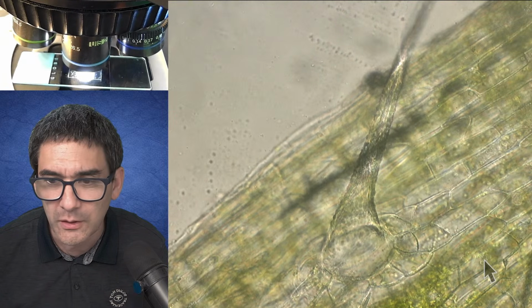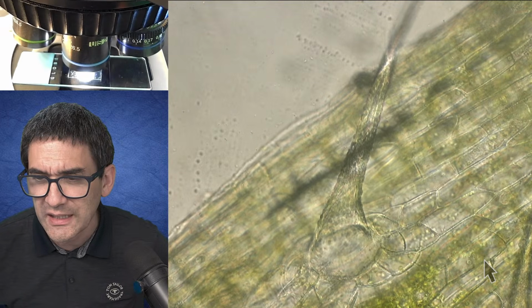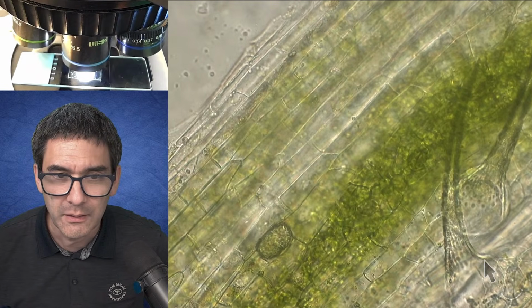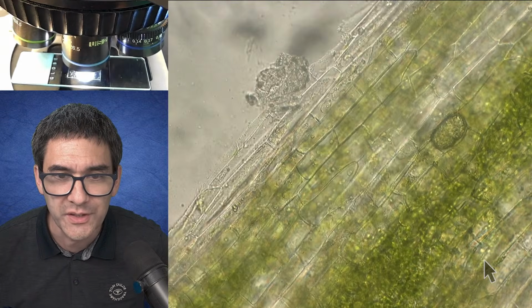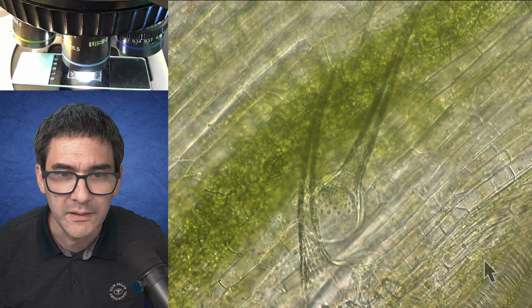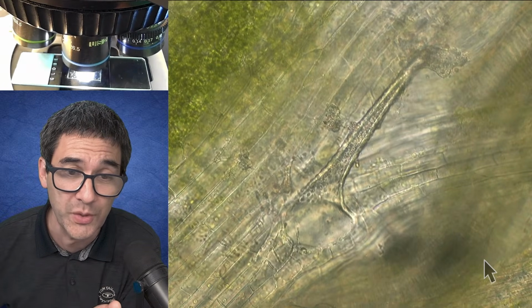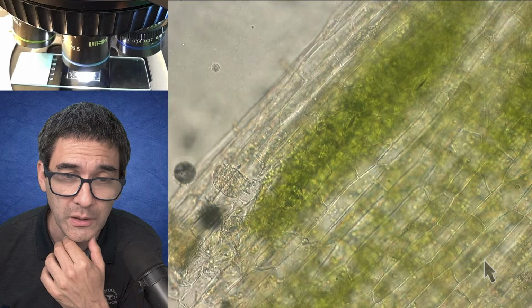So there is a comment here. There seem to be two different sizes. Are the large ones the stinging ones or both? Basically, I'd have to guess now, but I know that there are the larger ones on the side, and then there are, however, over here, plenty of other ones also around it. And I suppose maybe it is just a question of where they grow.